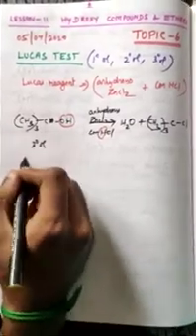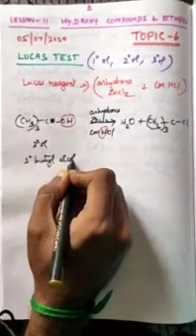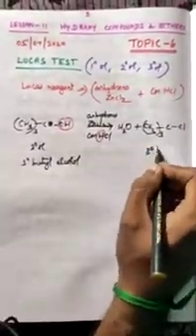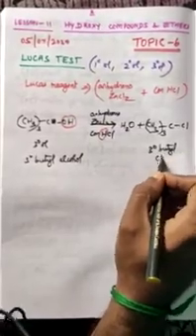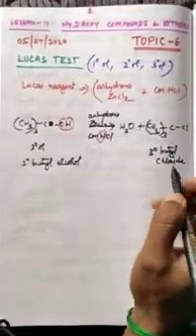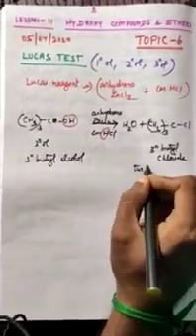Here it is called tertiary butyl alcohol. Now it has become tertiary butyl chloride. Tertiary butyl alcohol becomes tertiary butyl chloride. How can we recognize the formation of tertiary butyl chloride? As soon as the tertiary butyl chloride is formed, it gives turbidity immediately.